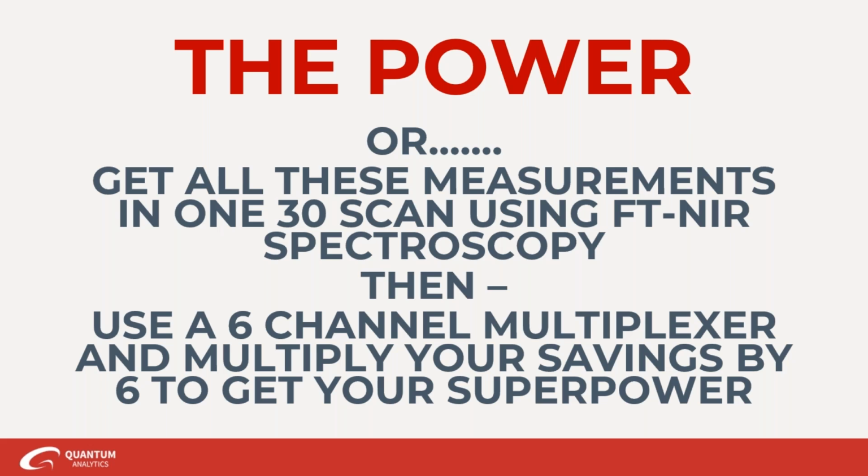I don't want to get too deeply into the actual mathematical techniques, but in these software programs where you do the chemometrics, there are different plots and things that you can look at that show whether something is an outlier or not. But you have to analyze those carefully, because you need to make sure whether it's really an outlier or not.